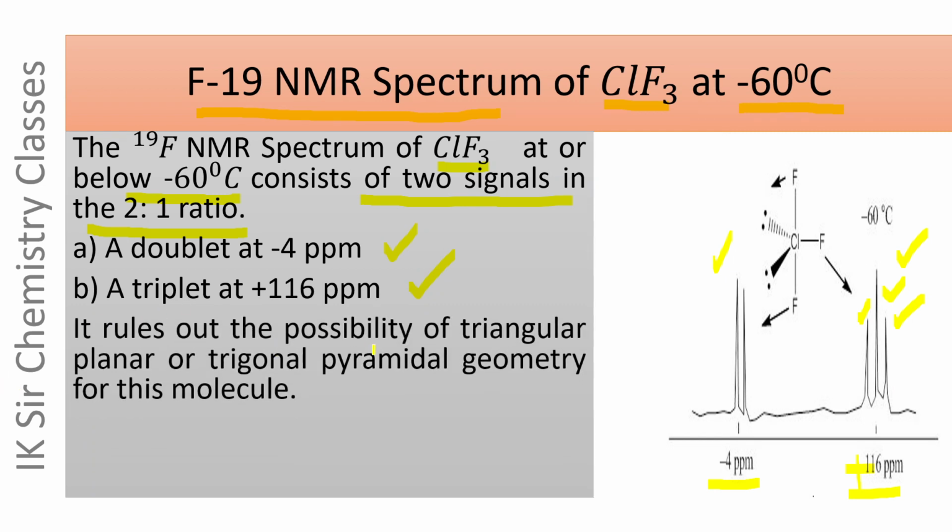It rules out the possibility of triangular planar and trigonal pyramidal geometry for this molecule.